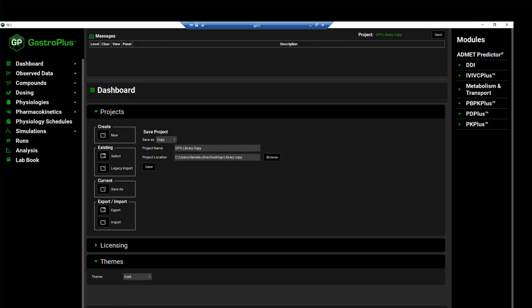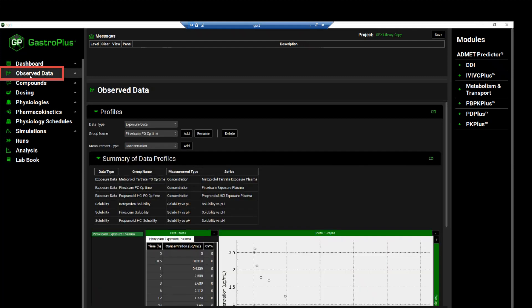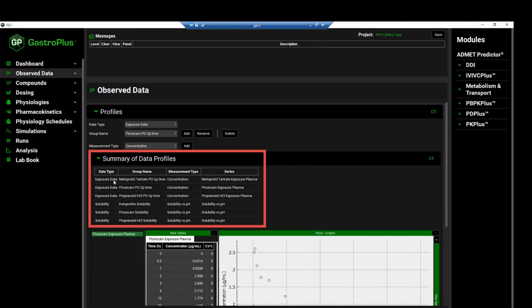We will now move through the views to see the data that has already been entered in this project. Moving to the observed data view, we see that three different types of exposure data entries have been already created, as well as solubility data has already been created for some of the compounds in this project.